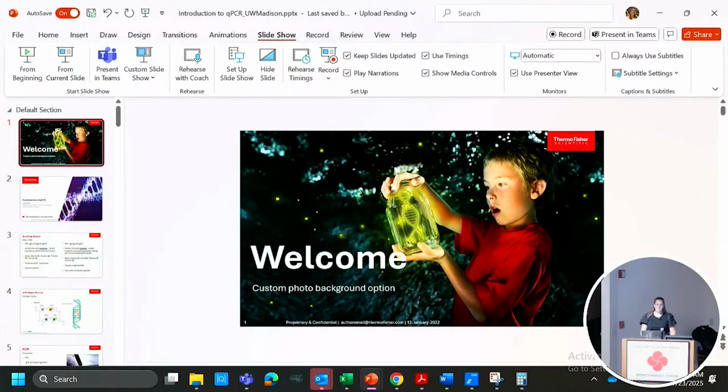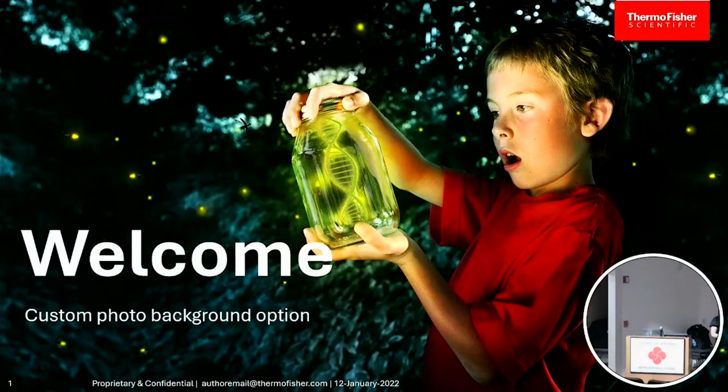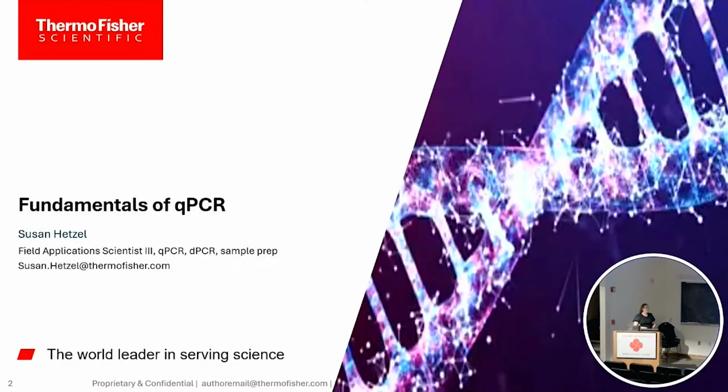So today, my goal is to set the stage on what is qPCR, why do we use it, and what do we want to use it for. And then after describing the nuts and bolts of how qPCR works, I'll introduce the topic of digital PCR.